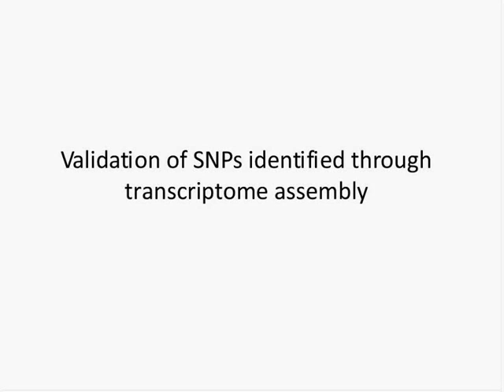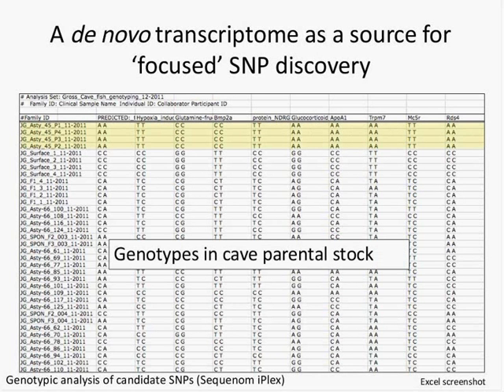So we have done that utilizing the Broad Institute. We have just genotyped about 1,000 markers in about 400 individuals, and it's turned out to be extremely successful. So we are very happy to report that almost all of the markers that we identified from our transcriptome assembly have been informative and are in the process of being placed onto our second generation linkage map.